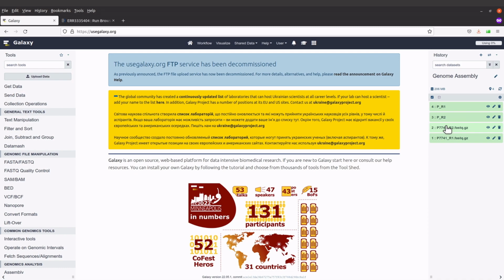Okay, so we are going to perform the activity. So let's proceed. And I repeat that these and these are the same, so you don't have to use all of them. You can choose to use these two or these two, but I prefer we use these two because we uploaded them from our PC. So that's about it, but the options are yours to decide. So let's proceed. Okay, we are now going to perform the exercise.